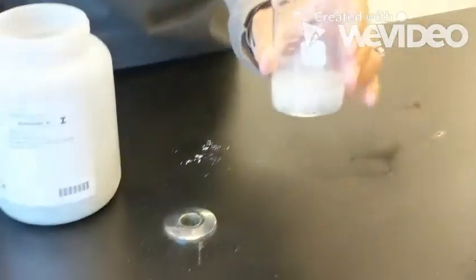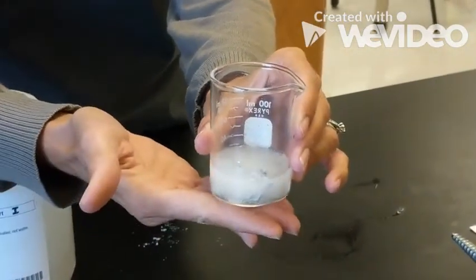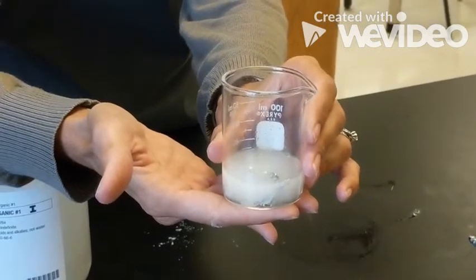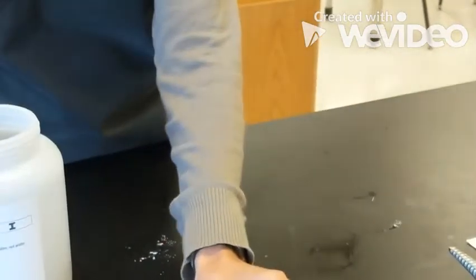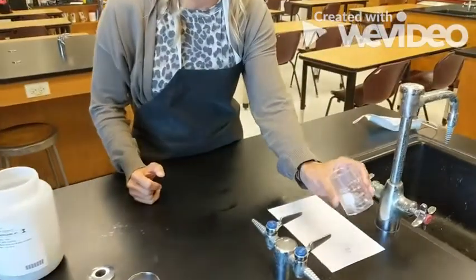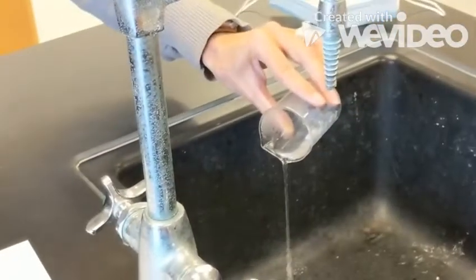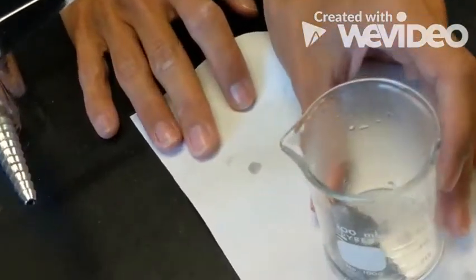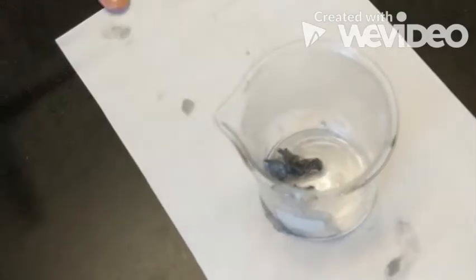And what you can see here in your after is you see some vigorous bubbles, and I will tell you that if I put my hand on the bottom of our beaker, it does feel warm. And I happen to have over here a reaction that has been sitting out for 5 minutes, and you can see what it looks like if I pour out the hydrochloric acid, what my zinc looks like. So make your after observations, and then let's figure out if it's physical, chemical, or both.